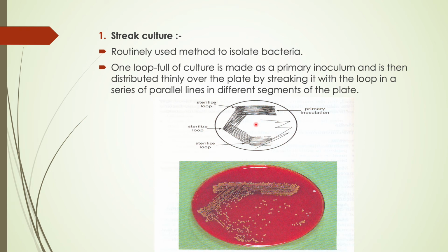So why do we need to use this procedure? Actually, we need to use this procedure to dilute the concentrations of the bacteria. Why? For example, see here, how thick is this? Okay, here, how thick is this? It's so thick, okay? So we cannot recognize actually if there is any contamination here, okay?